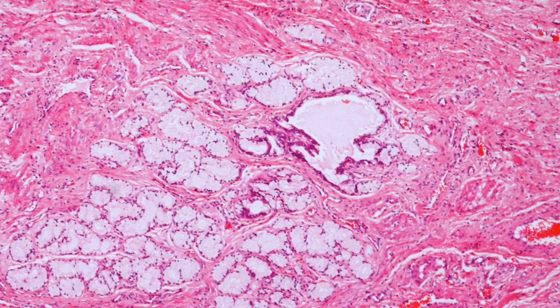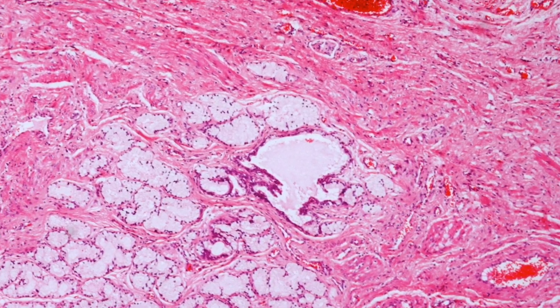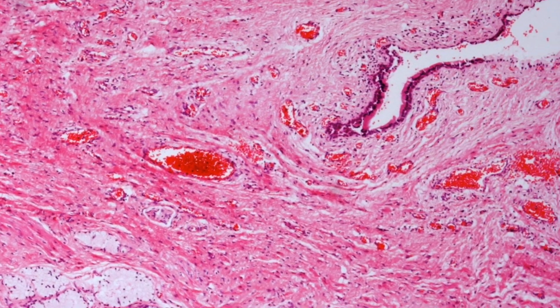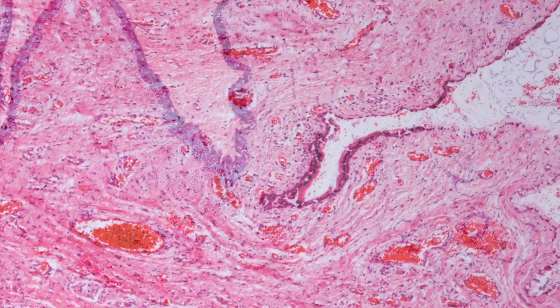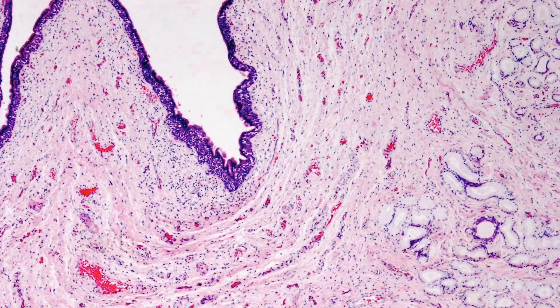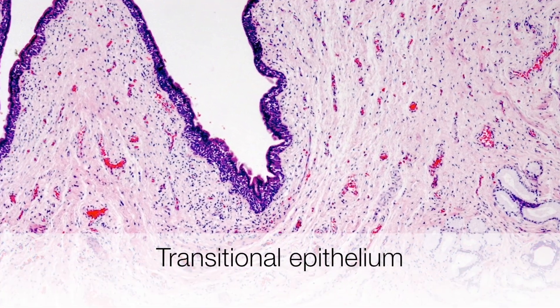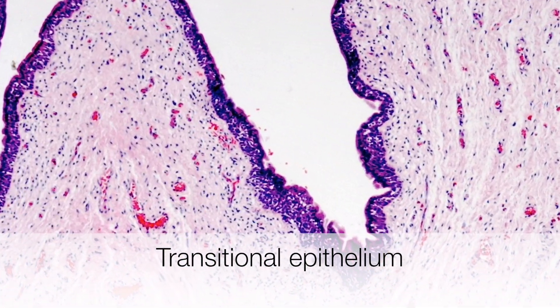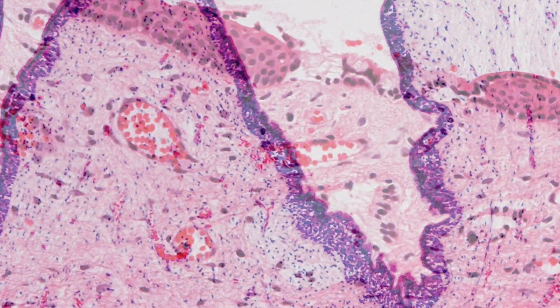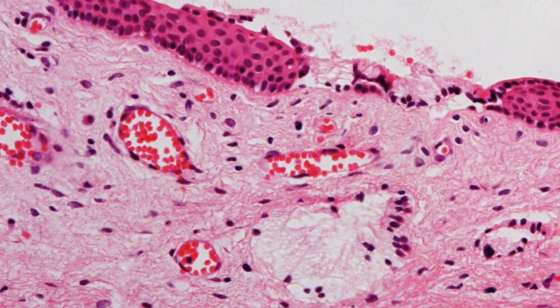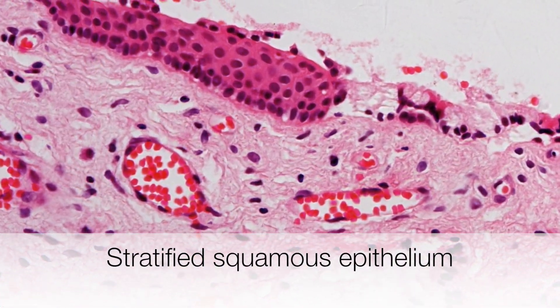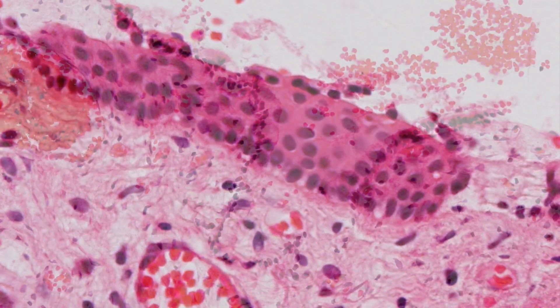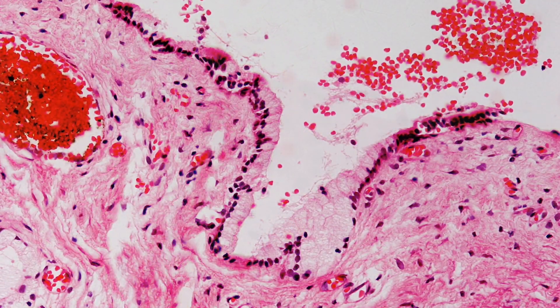Moving to the top right hand corner, the duct comes into view. This part of the Bartholin duct cyst is lined by transitional epithelium. Here we see stratified squamous epithelium, non-keratinizing of course, and finally there is the mucinous columnar epithelium.